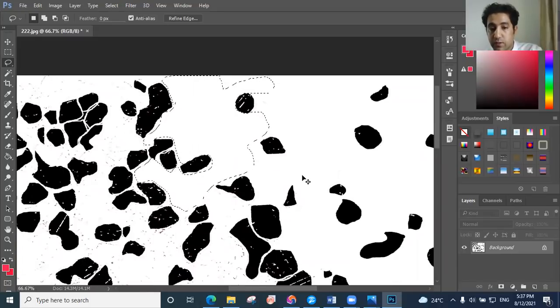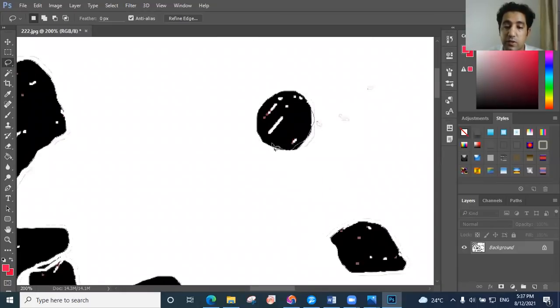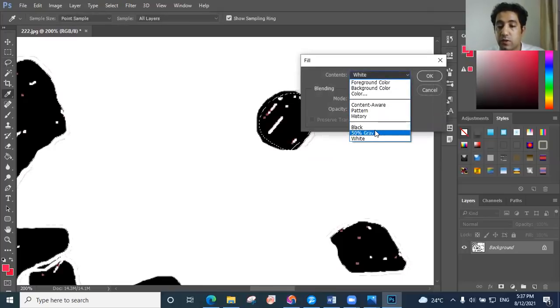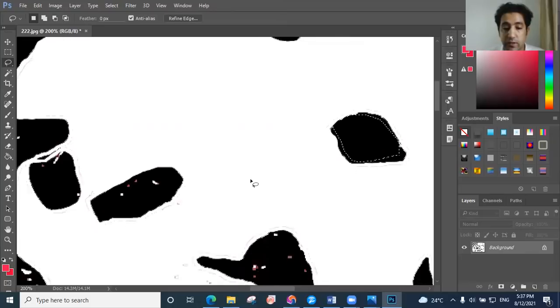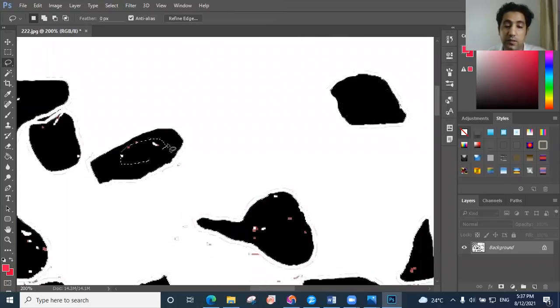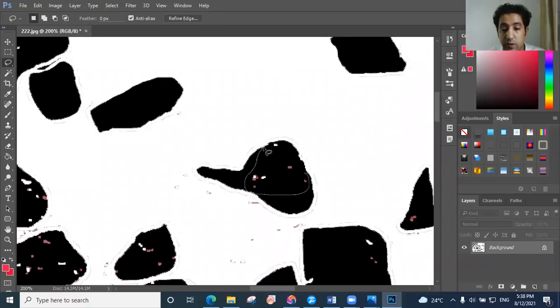All right, here. So this grain looks not good. Just circle it and make it all black. So nothing cannot be solved. Everything can be solved. Any problems, every problem, you can just do like this. And all right, because some issues will happen and you will not know how to deal with this, so it's better to watch this video.